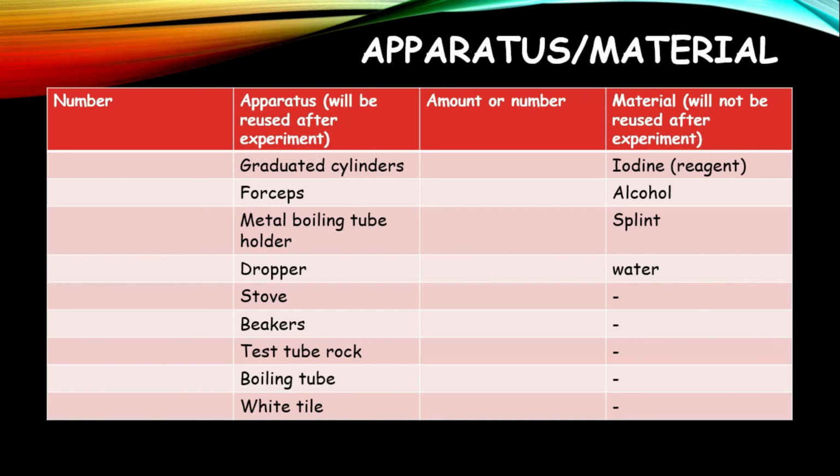Now, important to note, I have at the top here, look at the screen, I'm using my cursor, numbers, because numbers refer to those things that we can count. So you want to say how many of these you are going to be using. And over here I have number or amount, and this is because we are not going to measure the number of water. It's the amount of water, because that comes in volume. So we want to have an appreciation of that.